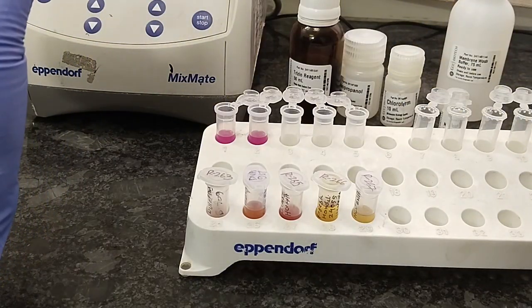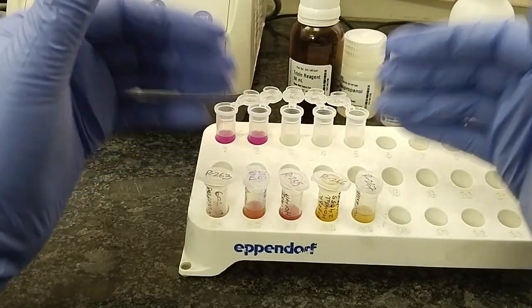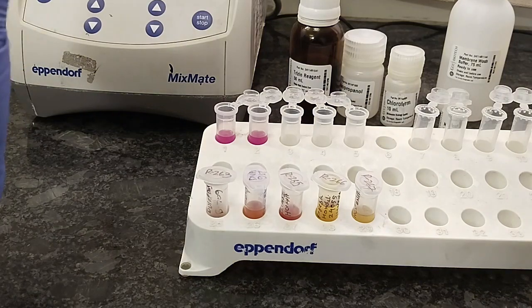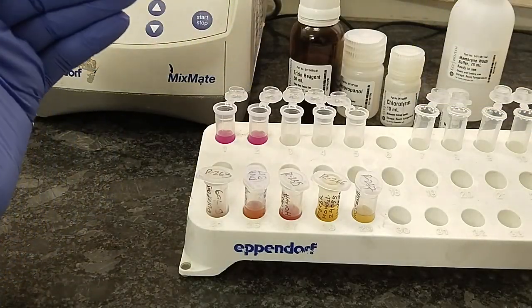For the treatment purpose, or for the medicine dose purpose, we have to determine the viral load. Unless we determine the viral load, the doctor cannot decide how much dose of medicine the patient should be given. So here our job is to calculate the viral load.